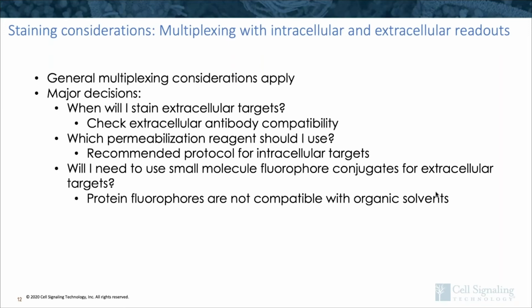If you can use your extracellular antibodies on fixed and permed cells, you might save some time by doing them in one step. But if your extracellular antibodies need to go on live, then you don't really have that option.